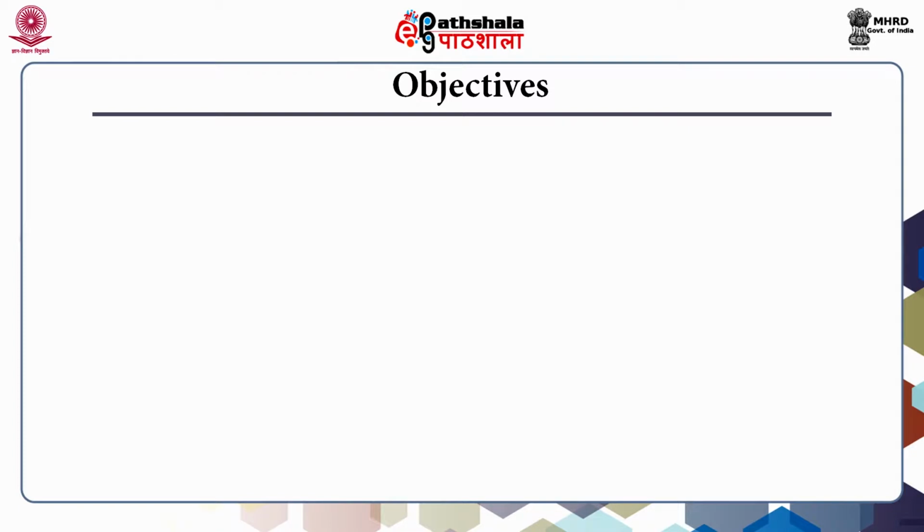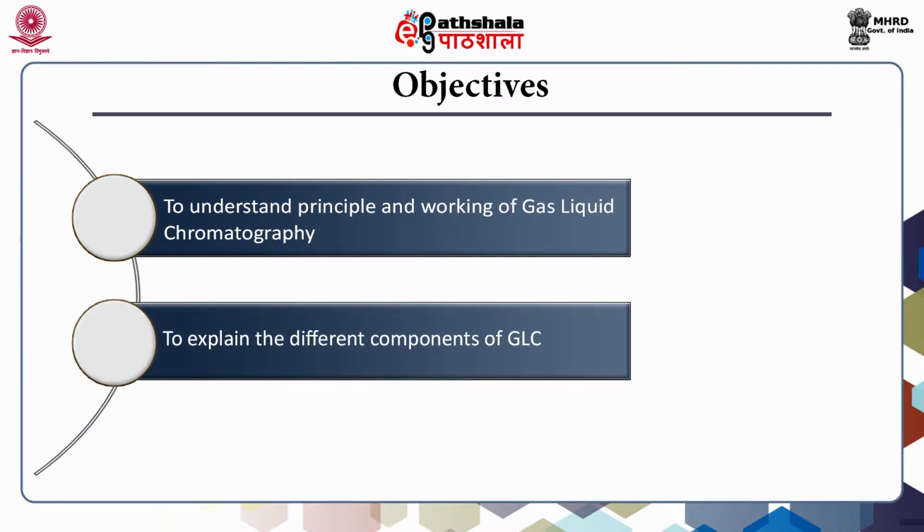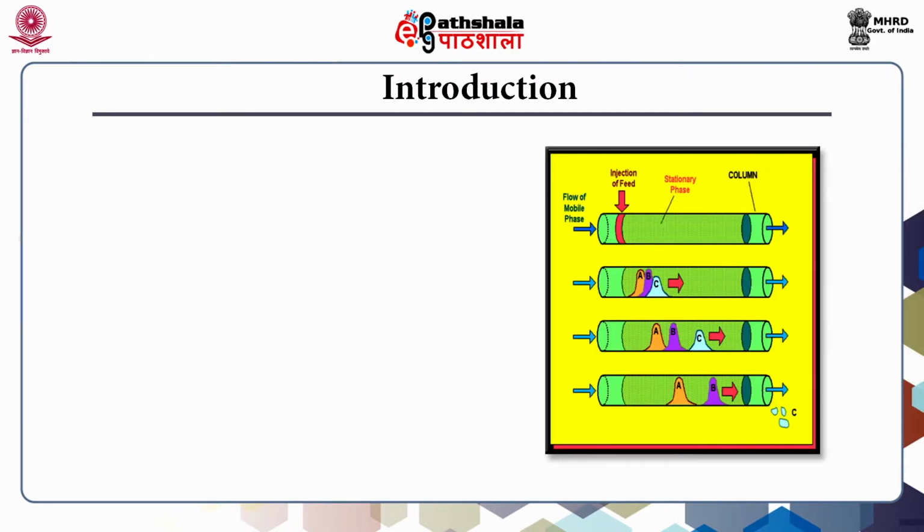During my lecture, I will be telling you about the basic principle of gas liquid chromatography, then the components involved in it, a little bit about its application, and then its working. So let us have the introduction, or we can see what gas liquid chromatography is.